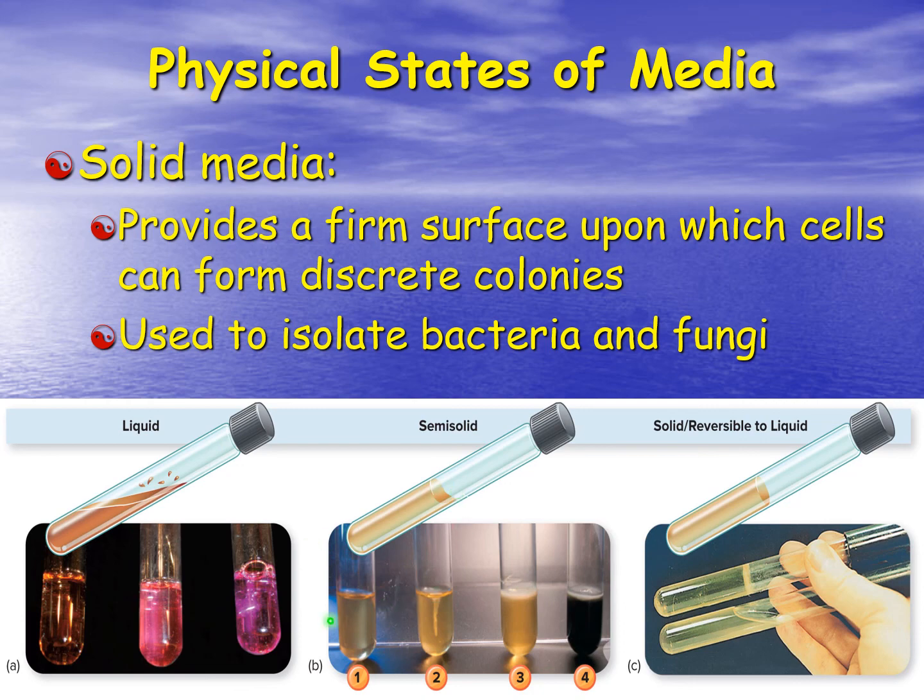Semi-solid medias, you can't really tell from the pictures, but you'll notice that we have done a stab line straight down and straight out with what we call the inoculating needle. And we can see that basically where we put the bacteria is where they're growing. They didn't move throughout the media. Whereas this one, number 3, we did the same thing. We did a stab line straight down, straight out. And as the bacteria grew, you'll notice that we don't really have that line anymore. The reason for that is the bacteria have migrated throughout this semi-solid media.